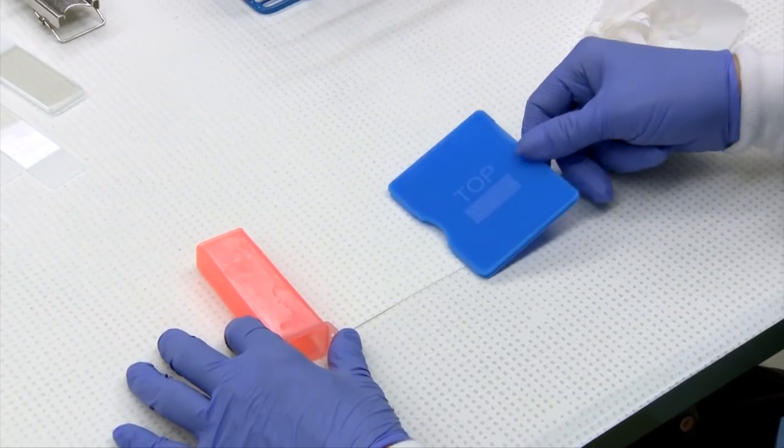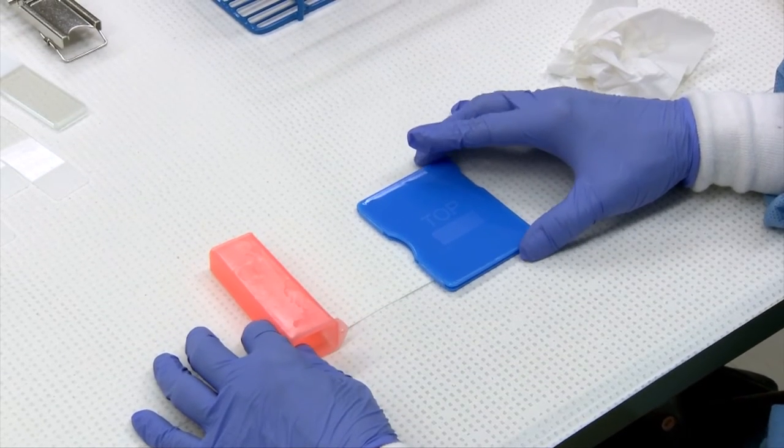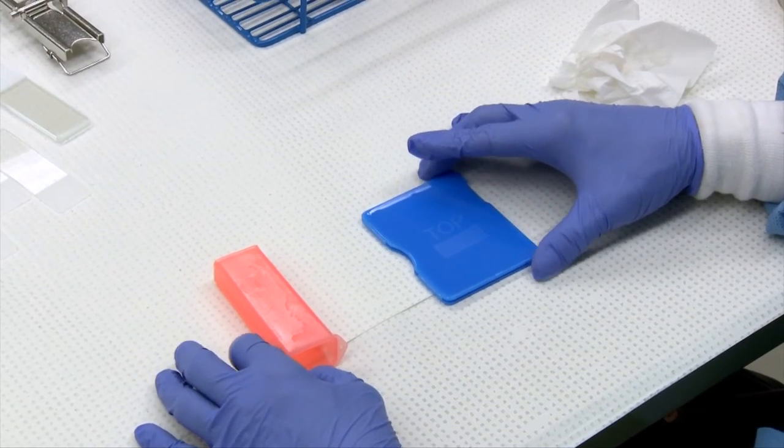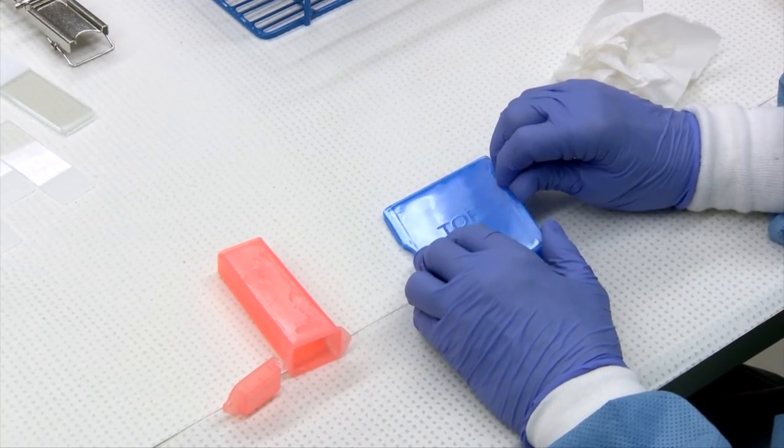And it's also important to separate any slides from formalin containing vessels. Otherwise the cell quality is terrible and you won't get a result on your cytology submission.